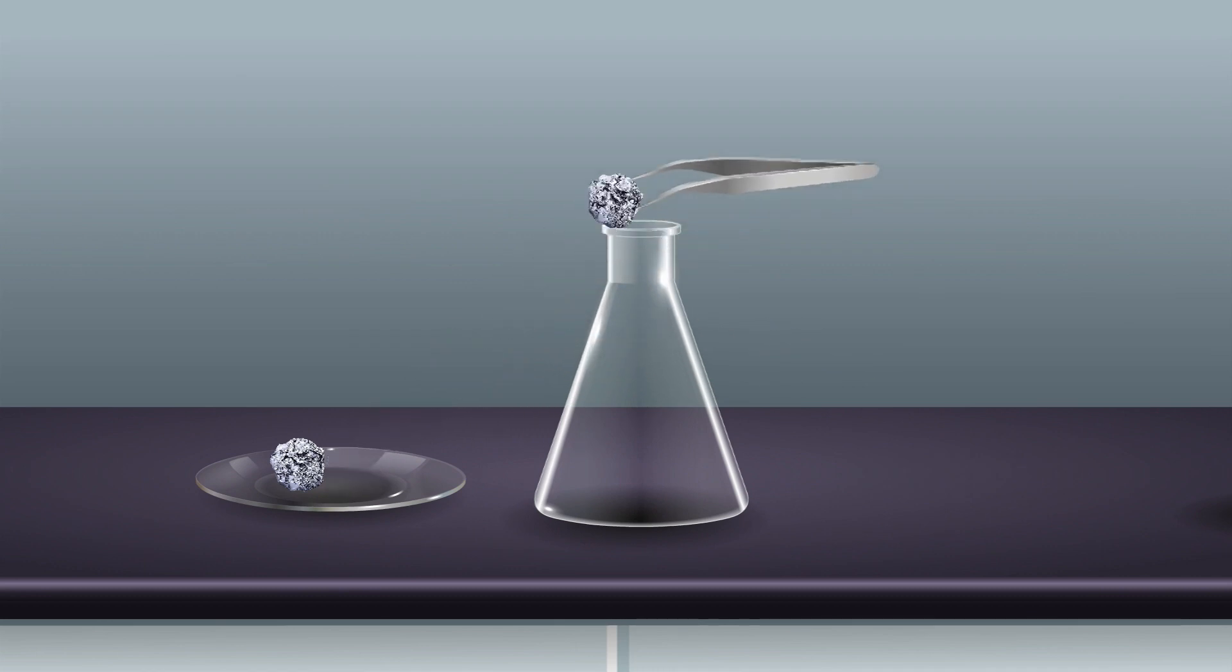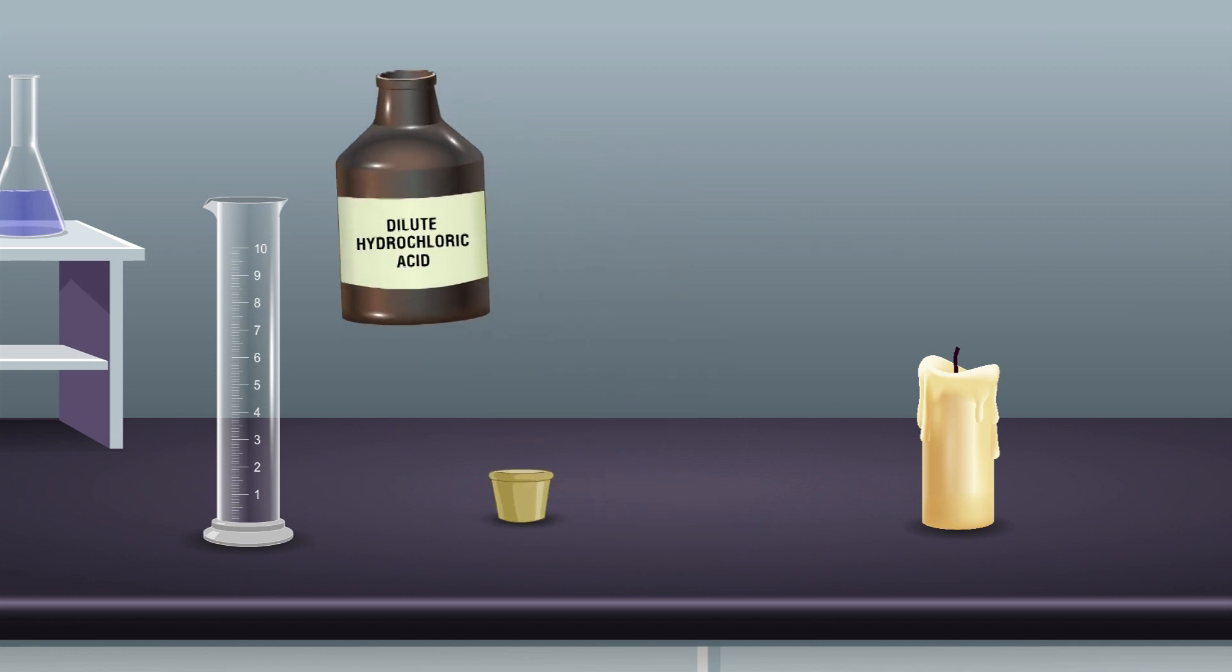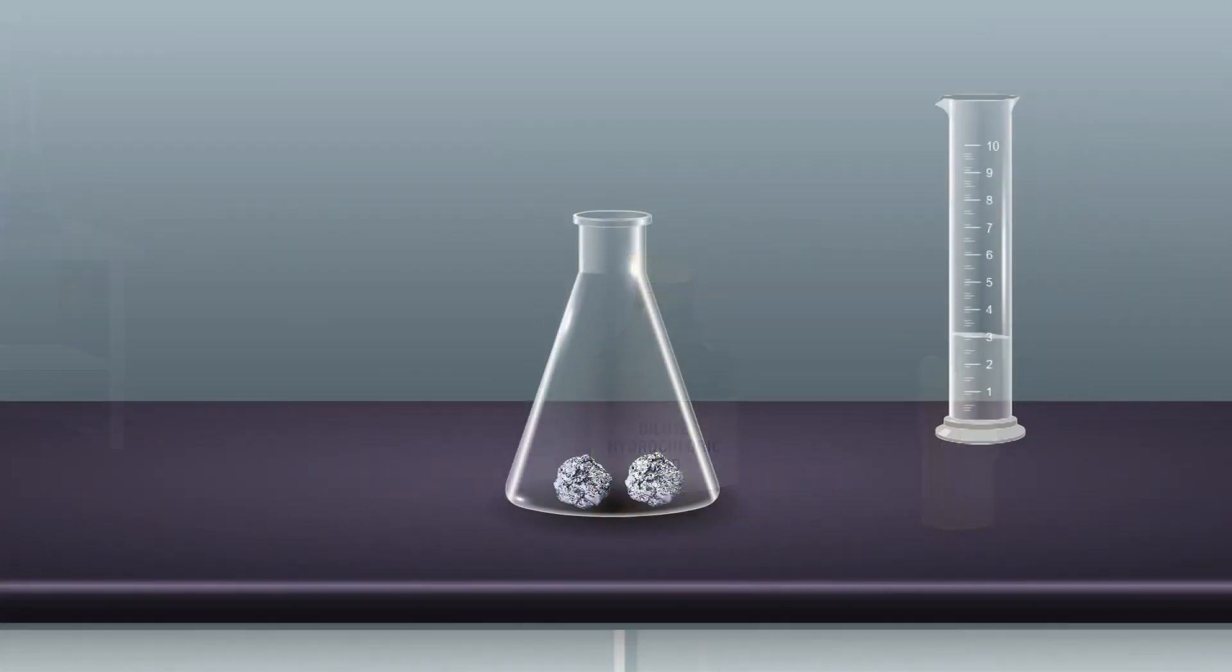Take a few pieces of aluminium foil in a dry conical flask using forceps. Pour 3 ml of dilute hydrochloric acid into the conical flask using a measuring cylinder.